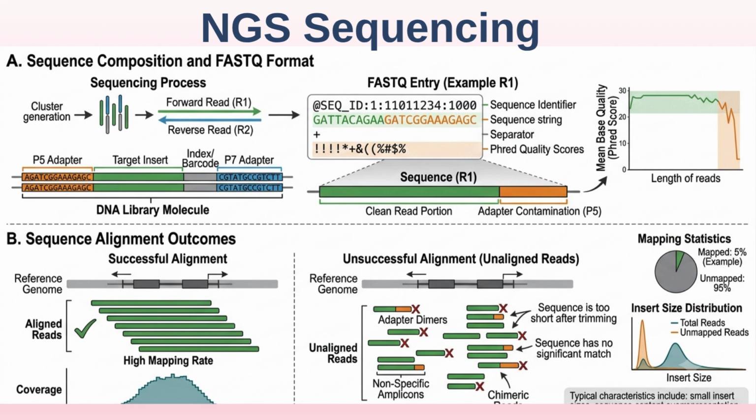If the assembly meets quality control standards, such as completeness, contamination thresholds, and contiguity, the genome can then be further refined. In some workflows, the final assembled genome may be circularized into a complete chromosome structure, especially for bacterial genomes that naturally exist as circular DNA molecules. From there, the high-quality genome assembly is ready for downstream bioinformatics analysis, including annotation, comparative genomics, and functional interpretation.